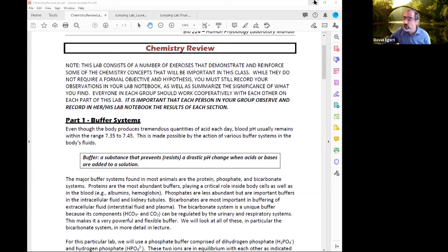It says, for each of the 3 parts of the lab, you're going to record the data and observations in your lab notebook as if you were personally doing it. So, write down what you actually see, what we describe in front of us. You will also have combined class data for the different groups performing the buffer protocol. Don't worry about that yet. We're going to talk about that on Tuesday.